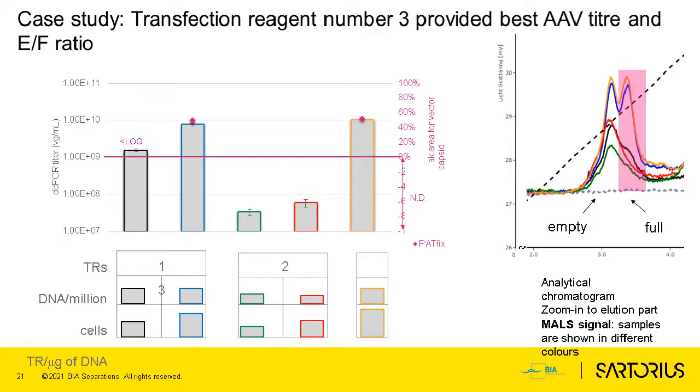And once again, in addition to the MALS HPLC, we would be using PCR, so we can double check in an orthogonal way if our results are correct, which is also shown in this graph. On the left you see the PCR results with bars. Different color means different experiment, and on the right you see the amount which was extracted out of the HPLC data.